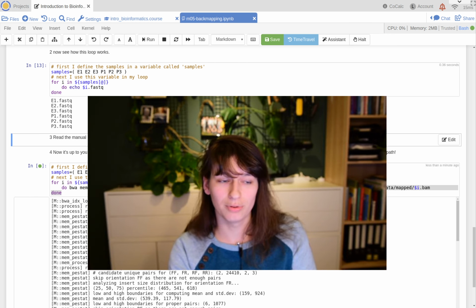So out of here come, instead of the 12 files we had earlier, 6 files, and in the next step we'll summarize this information even more.